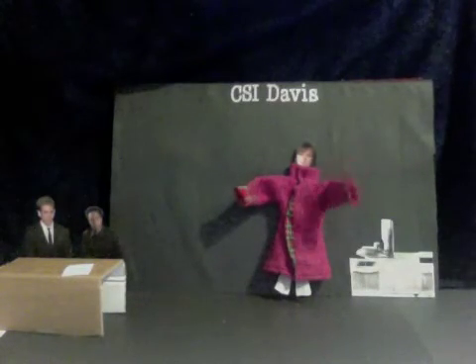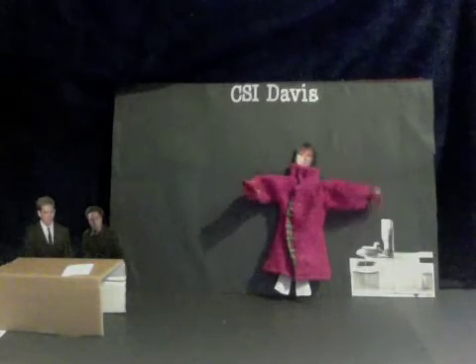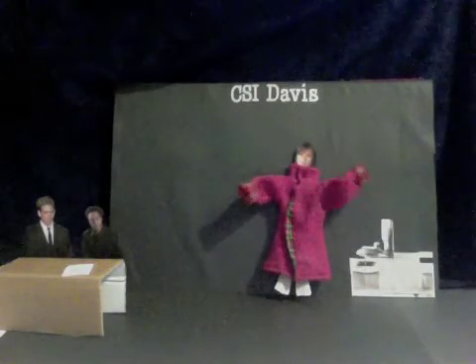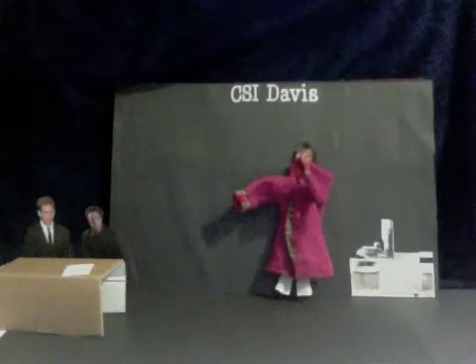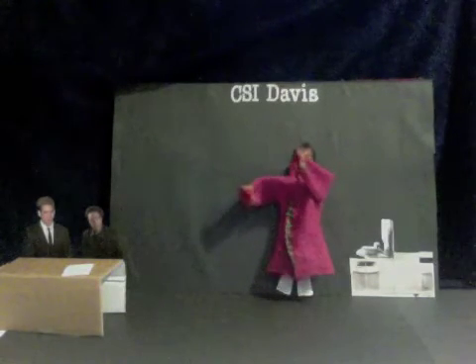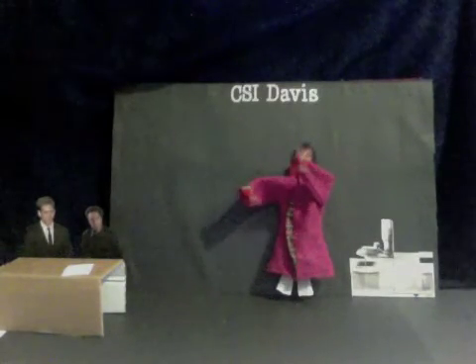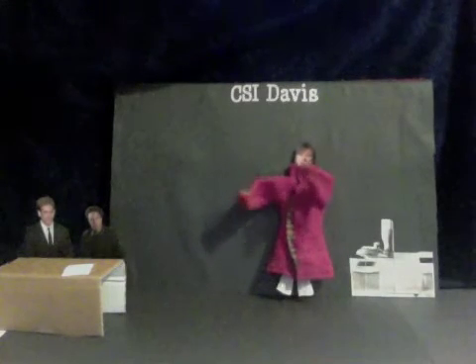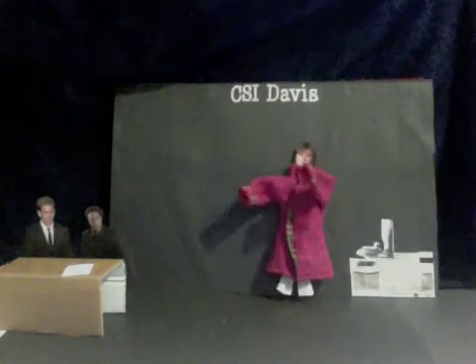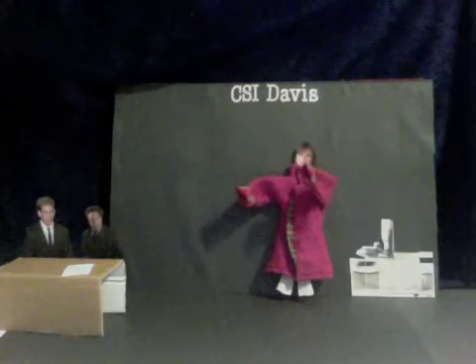Now, I'm going to load the mixture into the column. I use the injection port to load the mixture. The injection port will vaporize the injected mixture. Components with a lower boiling point will vaporize first. This vaporized mixture is then carried into the column by a carrier gas. The carrier gas can be helium, hydrogen, or nitrogen.